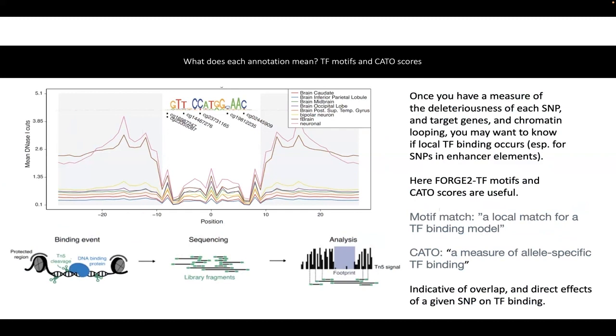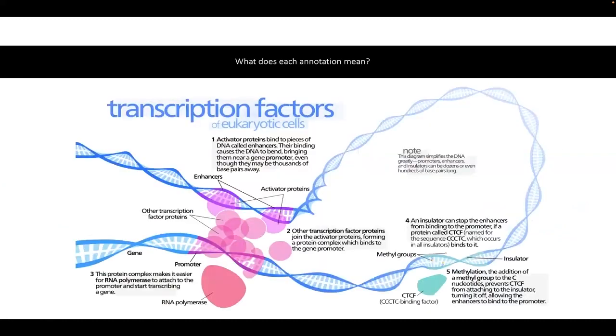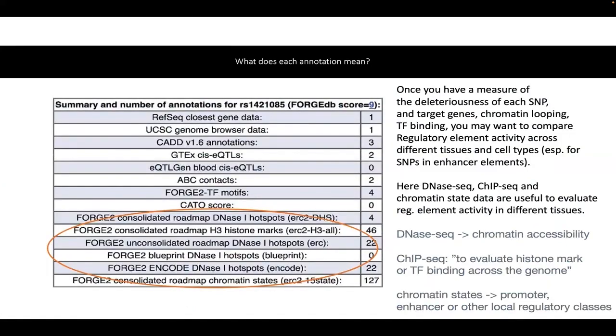So you have this sort of barcode-like signal. Can you see where the region is broadly accessible? Down here it's quite small, but I'm trying to show this at the bottom of the graph. It has little valleys in this peak, and those valleys are transcription factors, which are leaving their own footprint. So this is very useful. You can get some information on transcription factor binding in an enhancer.